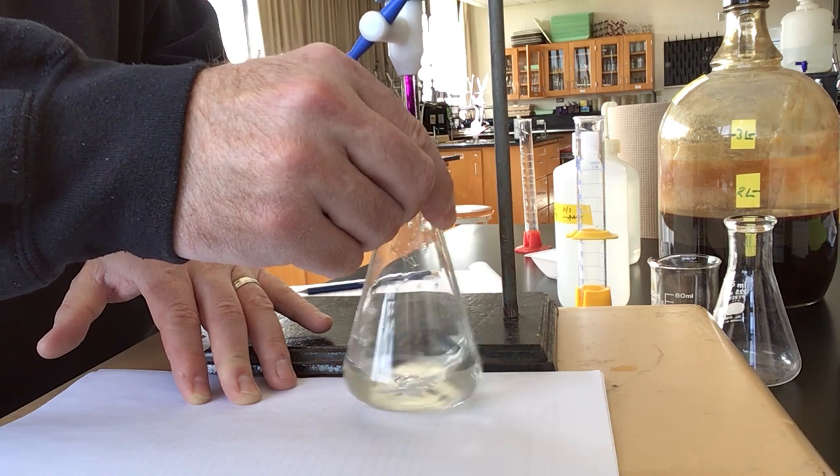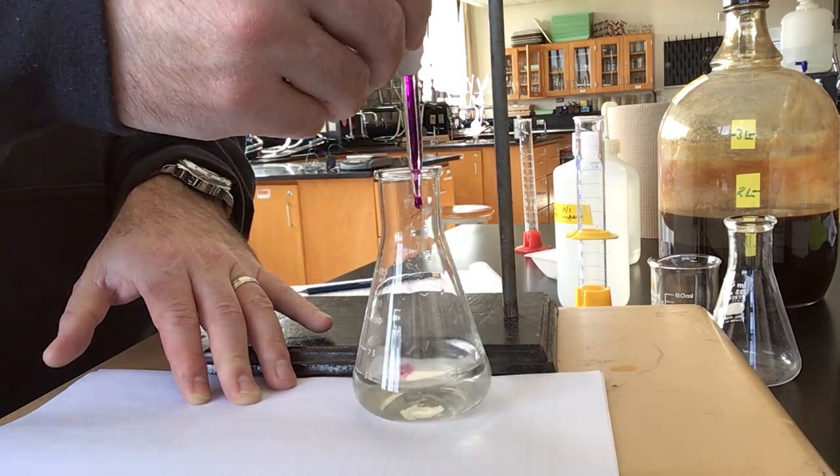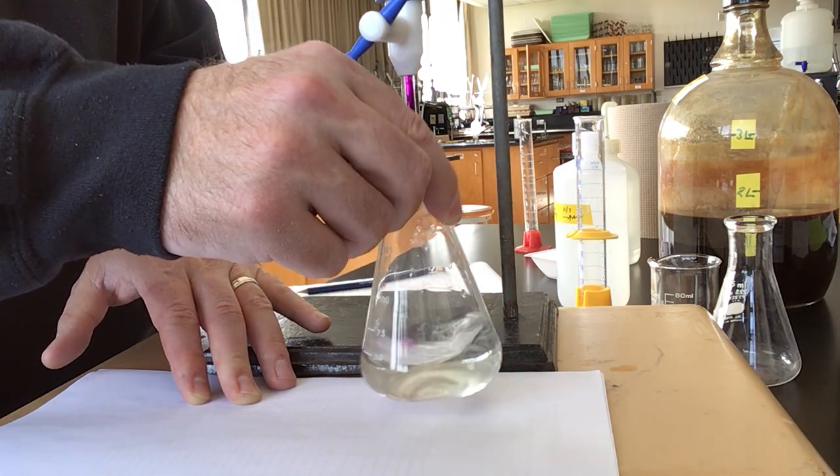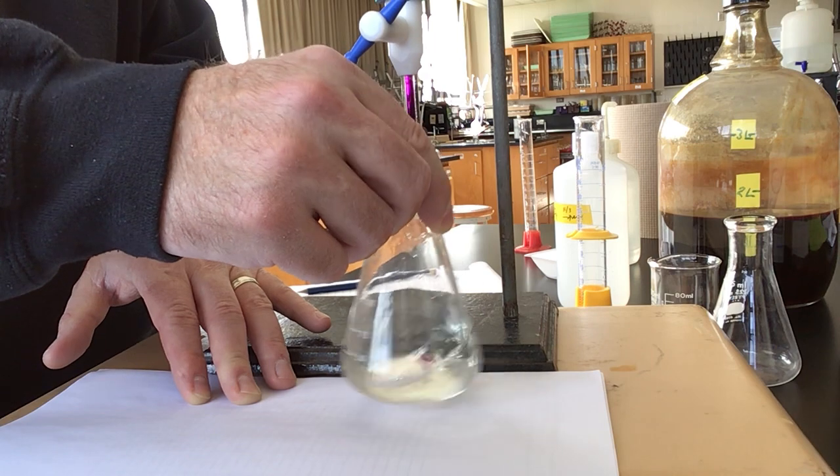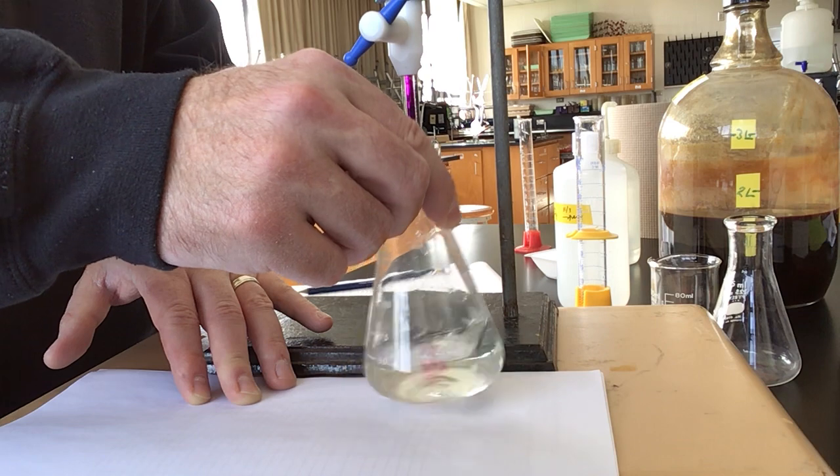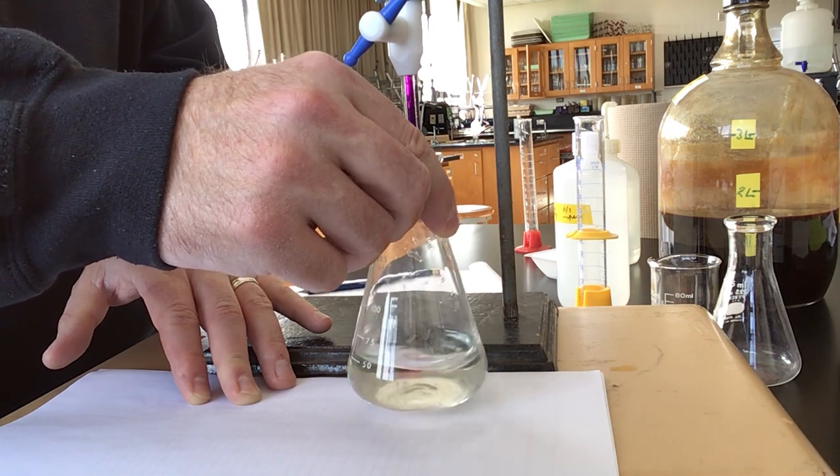you can always do a dummy trial to figure out how much titrant you should be adding approximately. In those dummy trials, you generally overshoot the endpoint, but you end up with a value that's really close to what it should be. That way, for your subsequent trials, you can go really fast up until you get close to the endpoint, and then add drop-wise slowly mixing.